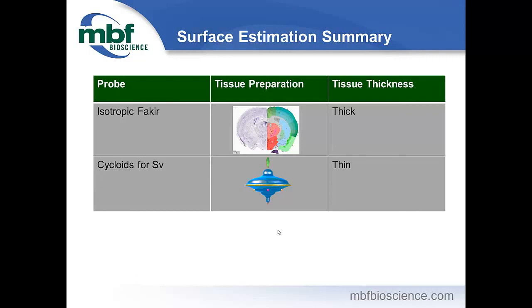One last thing about length is tissue shrinkage. So the way that you prepare your tissue is of extreme importance for length estimation. The estimates we'll be getting will be on the tissue as the artifact has left it.